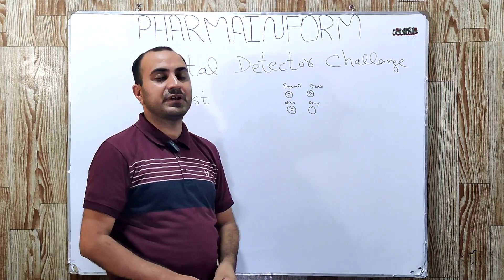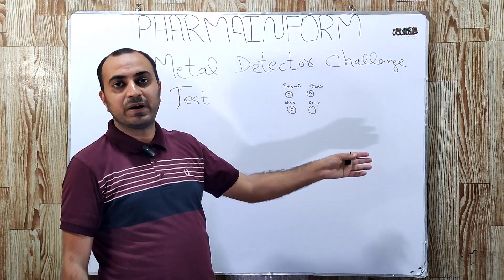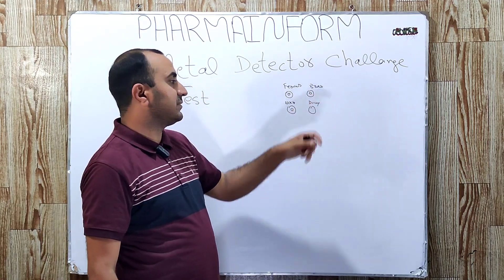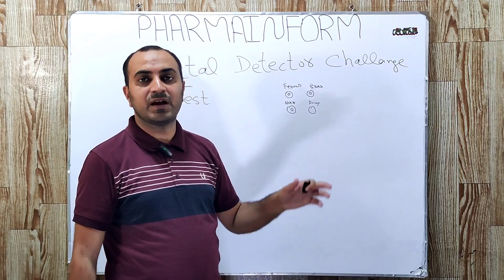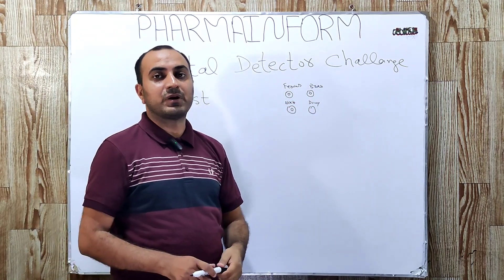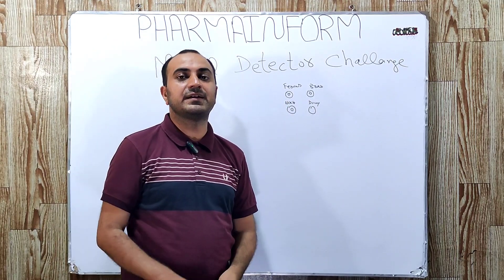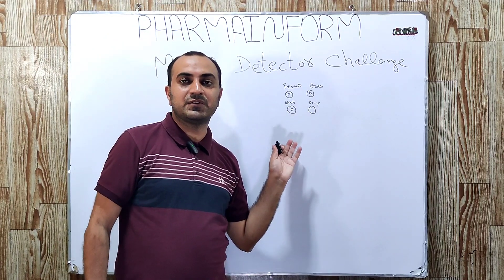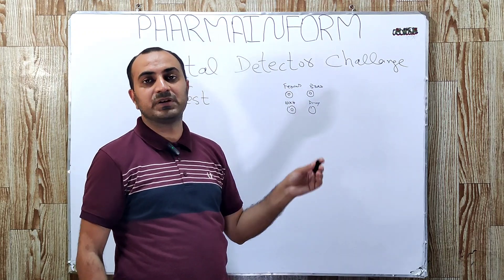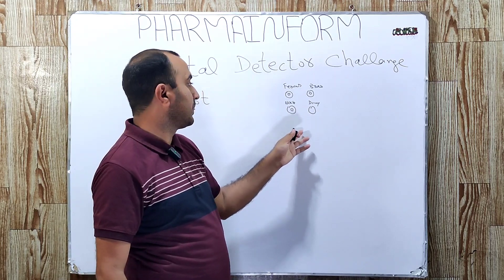Next is the brass tablet. We pass the brass-containing tablet through the metal detector, and if it is rejected, it means our metal detector functionality is good for brass detection. Next is the nickel-containing tablet. In the same way, if this tablet is rejected, it means our metal detector sensitivity for nickel detection is good.